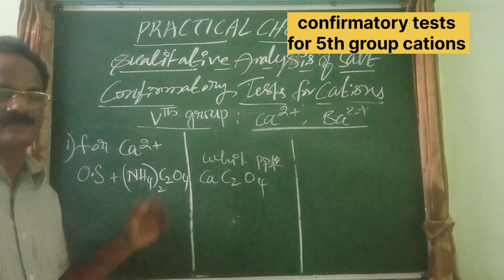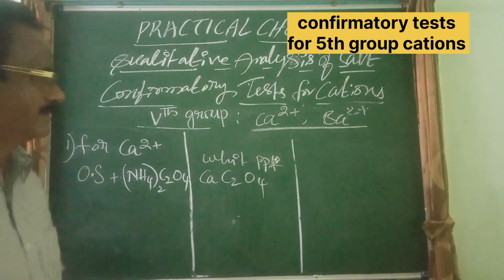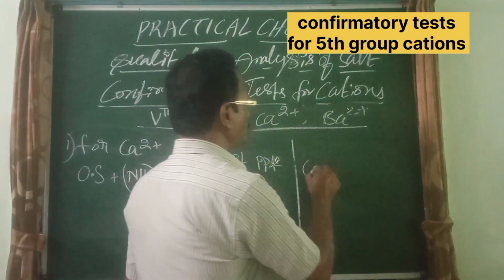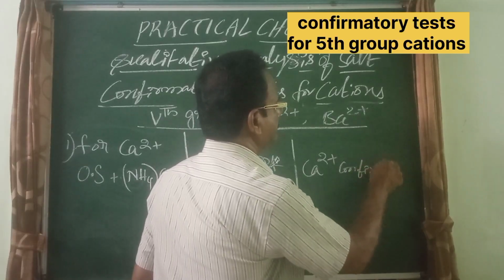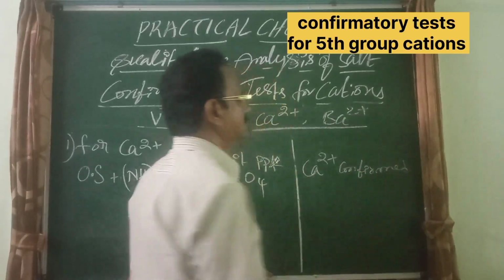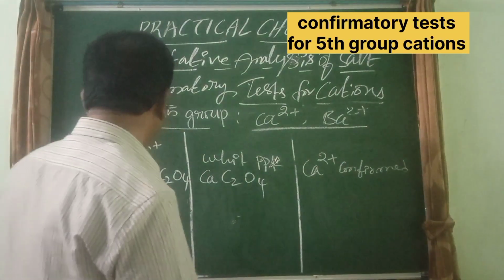See here what is happening. The ammonium is replaced by calcium. Calcium oxalate. Ca2+ confirmed.